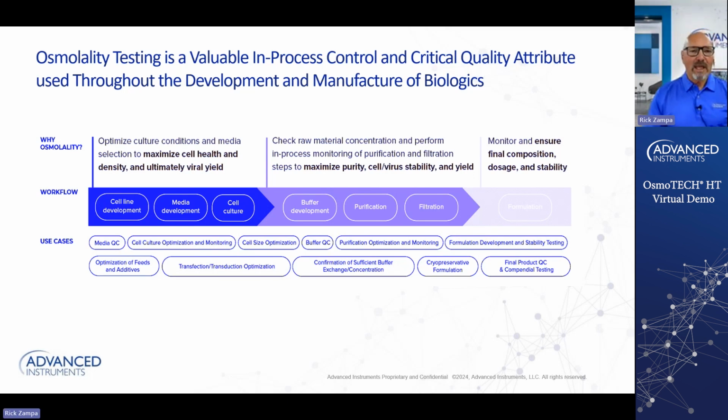In downstream purification workflows, osmolality is used to confirm buffer concentrations and help ensure buffer exchange and measure the concentration of the drug substance. And finally, in formulation, all the way from development through fill and finish, osmolality is a critical quality attribute that provides valuable information about the identity, safety, purity, and stability of the drug products.